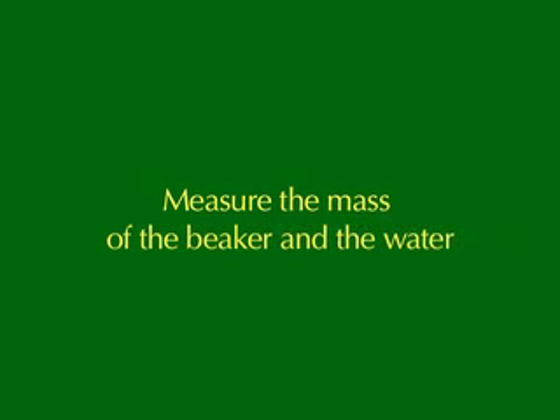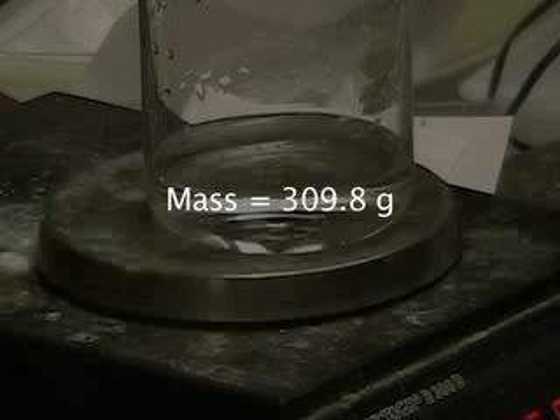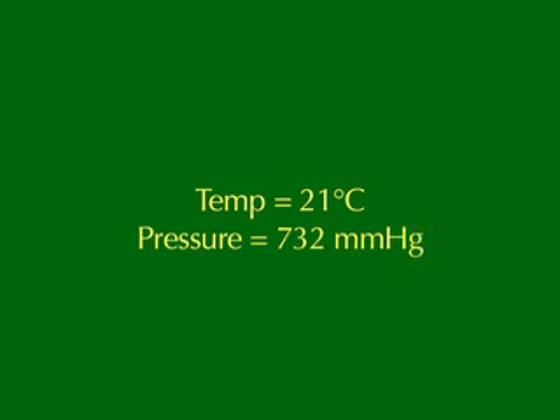After the reaction is complete, the water that has been collected is measured. Then, knowing the room temperature and pressure, we can calculate the number of moles of hydrogen gas that were produced by the reaction. We can then calculate the mass of aluminum and mass of zinc that was present in the original sample, based on the amount of hydrogen that was produced.